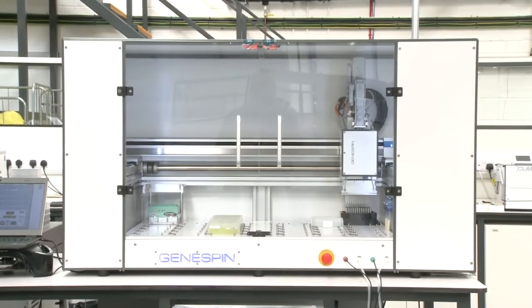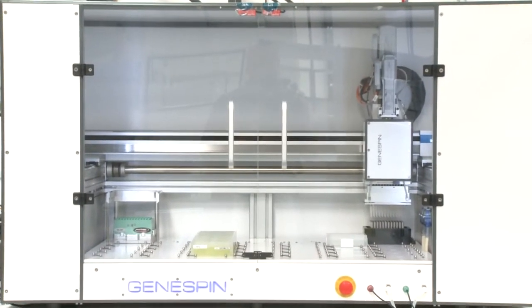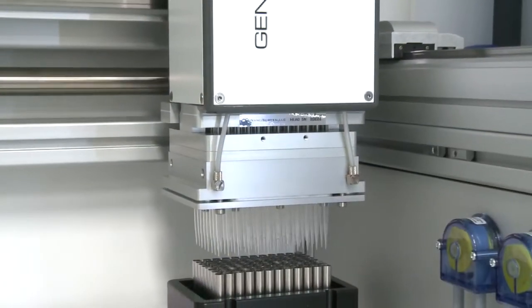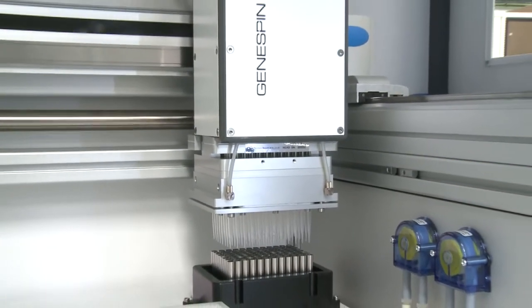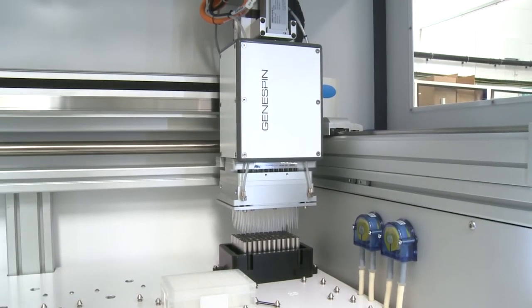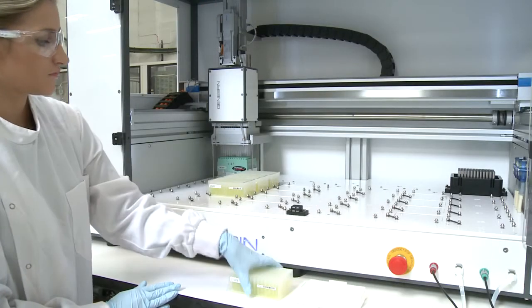Hello and welcome to the family of next-generation automated extraction platforms from LGC. The GeneSpin robotic system is capable of ultra-high throughput DNA extractions using the clear gene chemistry from nearly any source material, yielding high quality purified DNA for downstream applications such as PCR, SNP genotyping and Sanger sequencing.